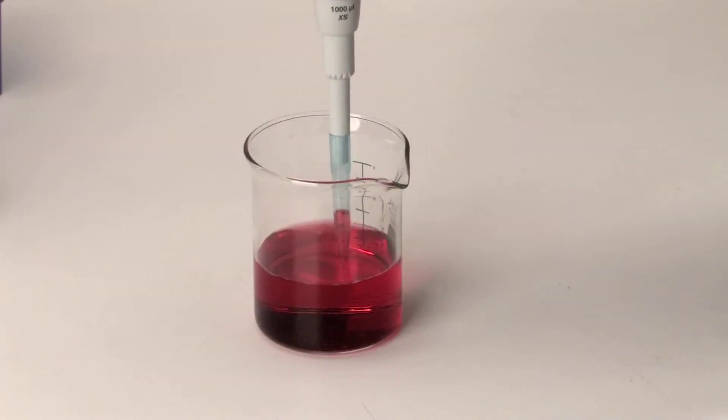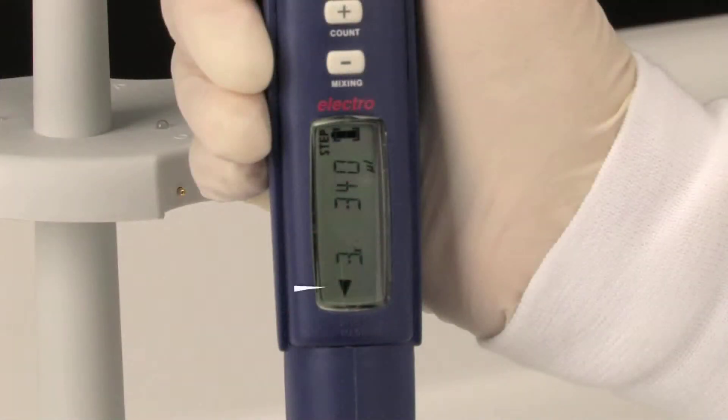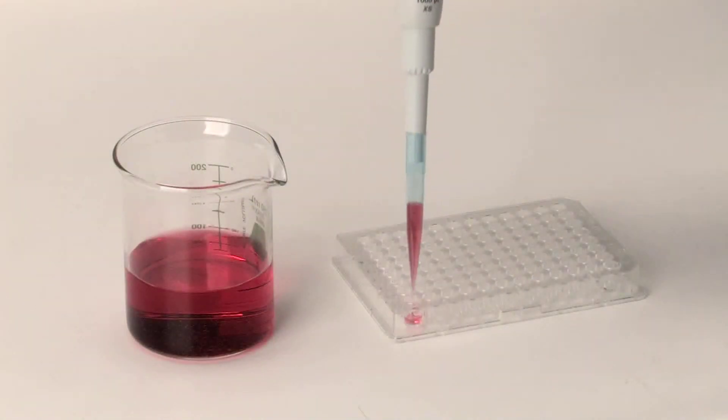Push the start button to begin aspiration. The display with the triangle pointed down shows that the unit is ready to dispense. Simply push the start button to begin first dispensing. Every subsequent dispensing reduces the number of remaining aliquots.